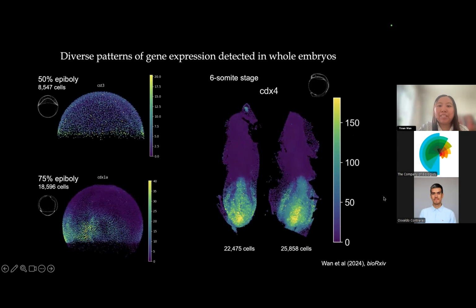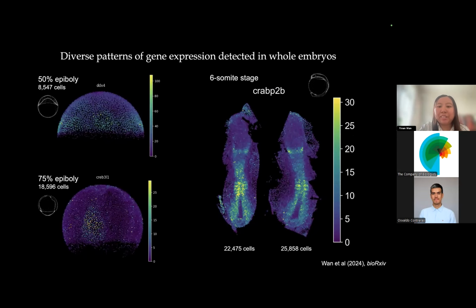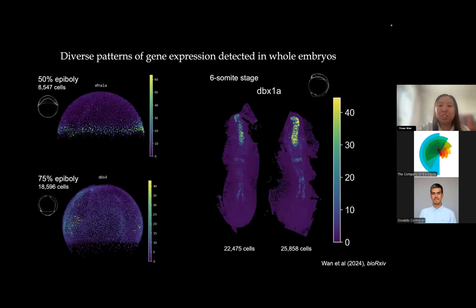They may look like 500 in situ hybridization patterns, but bear in mind that here every single cell has 500 genes probed in them simultaneously, and if you zoom in, you can even see the subcellular distribution of the transcripts.